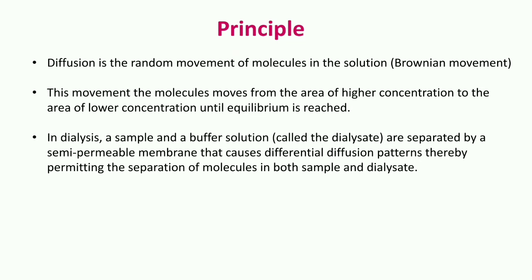So in the dialysis technique, a sample and a buffer solution is required. The buffer solution is also known as dialysate. The sample and the buffer are separated by the help of a semi-permeable membrane. This leads to differential diffusion patterns, thereby permitting the separation of molecules in both sample as well as the buffer.